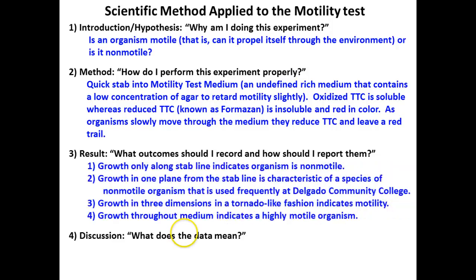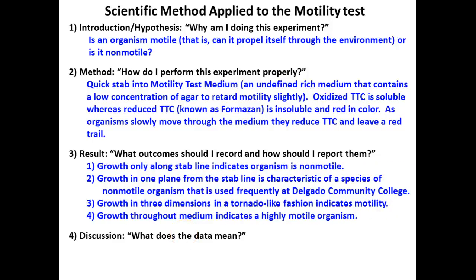So what are we going to record? Right, we're going to record growth along that stab line.